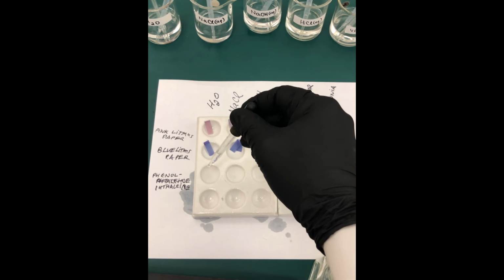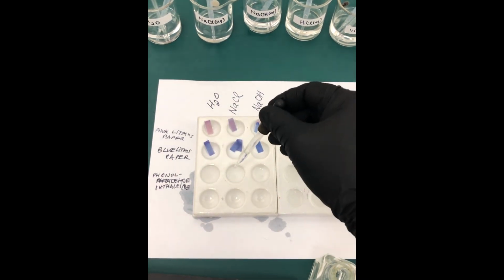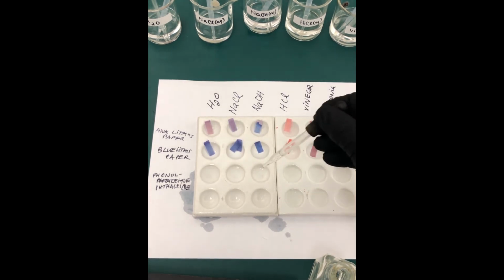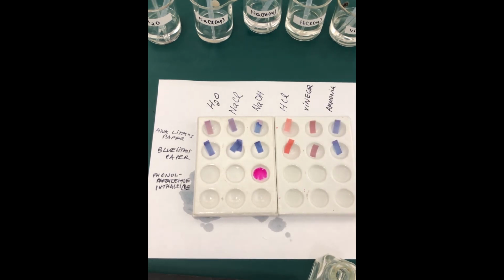So here is water. Let's see what happens. Absolutely nothing. Let's see what happens with NaCl. Absolutely nothing. What about NaOH? Ooh, we have a pink color there, actually a very bright neon pink. Let's see HCl. Nothing happens there. Vinegar. Nothing happens there. Ammonia. Oh, we got the pink color all over again.